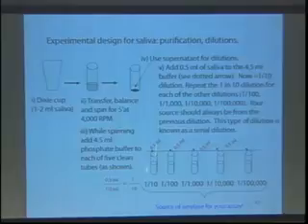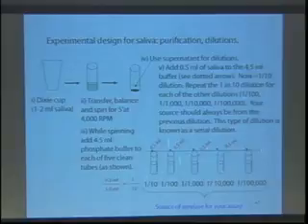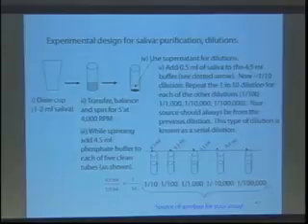Every semester, okay? So 1 in 10. To get a 1 in 100, you just take half a ml of this 1 in 10 and add it to that 4.5. This is now 1 in 10 of that, which makes it 1 in 100. And it's in this series. Does that make sense? So it's a serial dilution. That way you just go right down the line, okay? It turns out the amount of enzyme activity is so high in the 1 in 100 and 1 in 1,000 that your solution will probably be jet black when you heat it up, and there's no way you can take an OD on it, okay? So there will be a value where you can get a nice reading on the spec.